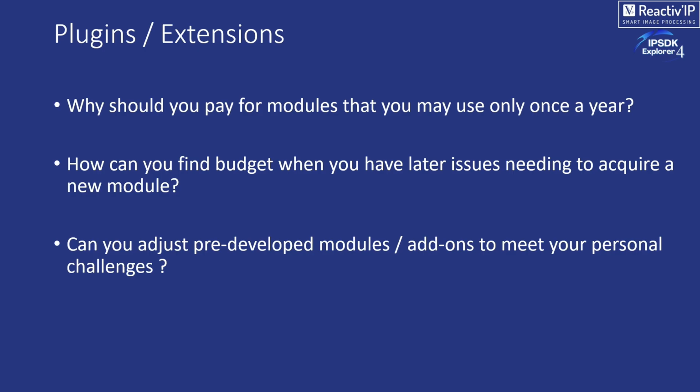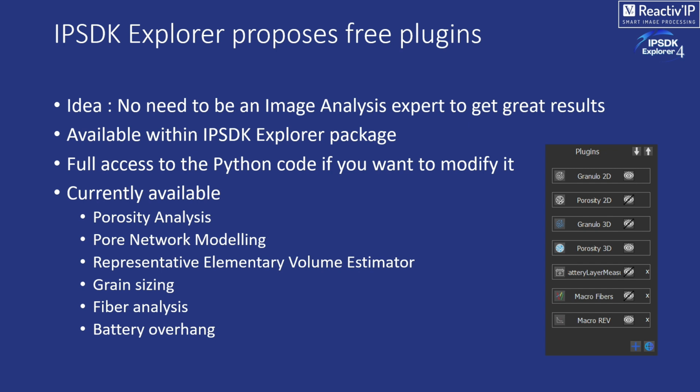So we've been traveling a lot during the year 2024, last year, discussing with our users, making workshops, making user meetings, trying to understand how our users were using IPSDK and what the feedback on the usage was.